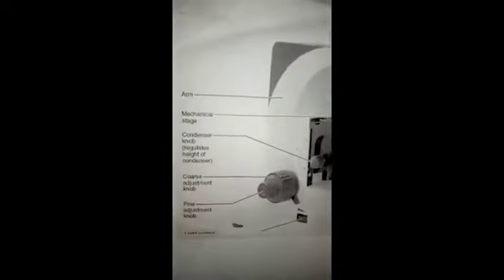Now, how do you care for the microscope? To clean the microscope, there are special liquids, such as xylene, and special filter cleaning papers. After using the microscope, store it in the cupboard so that it will not gather dust.